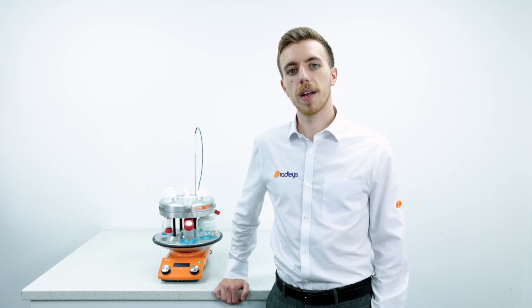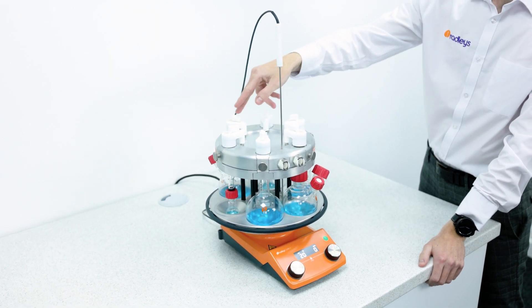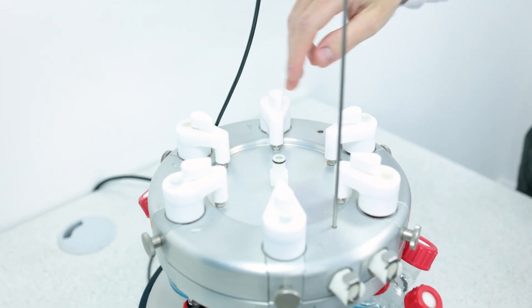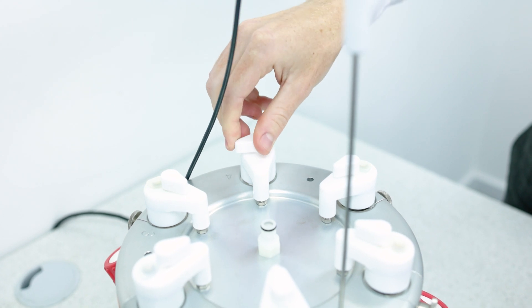The reflux head on top has three quick-release couplings — one each for water in and out — allowing water to be evenly distributed around the head, replacing the need for traditional condensers. The final quick-connect allows supply of inert gas to each of the reaction positions. There are O-ring seals on each connection, and a shut-off valve on each easy-on cap allows regulation of the inert gas supply.